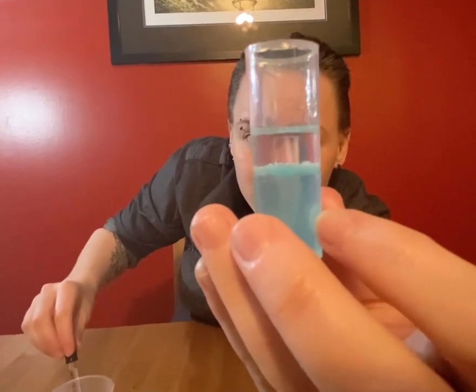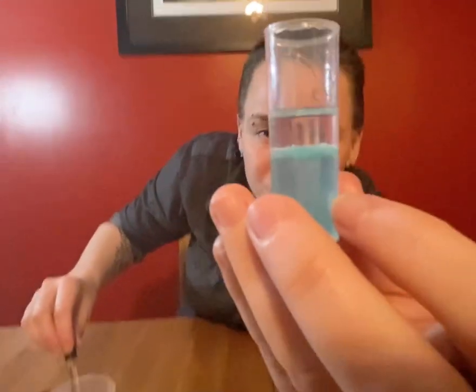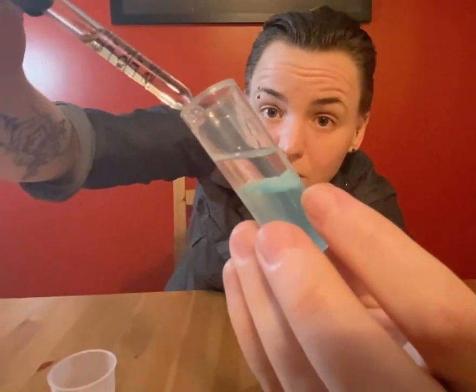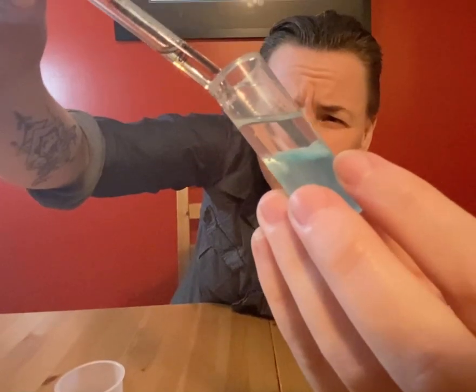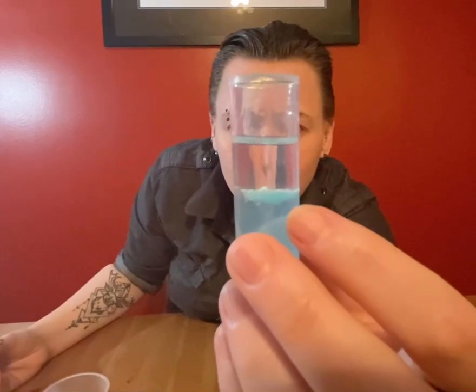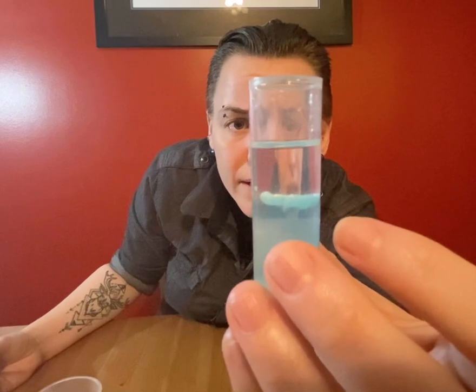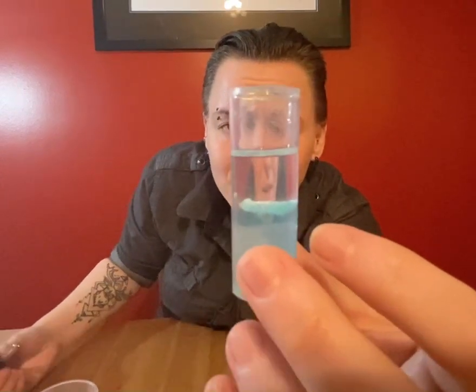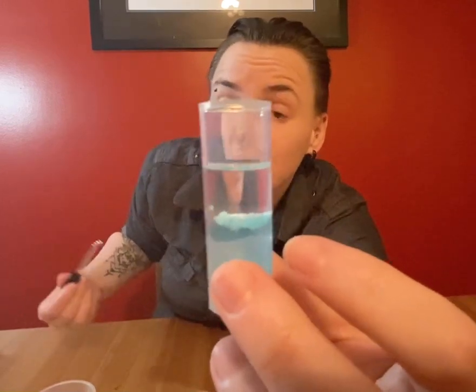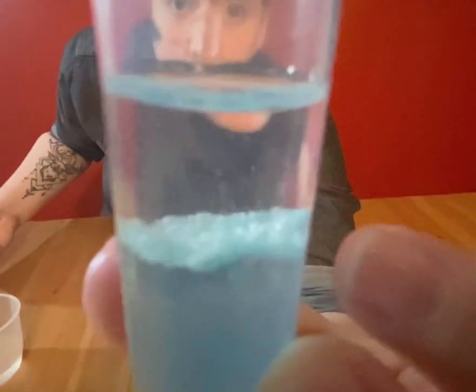And you can kind of see that there are little wisps appearing. It almost looks like cobwebs. That is actually my DNA. So we're going to put some more in. This ends up being about 2 to 3 milliliters of alcohol. And you can see that there are all these little wisps appearing and all these little bubbles. That's the process of the DNA actually becoming a solid in the presence of the alcohol. You can see that there are some pretty obvious wisps appearing.